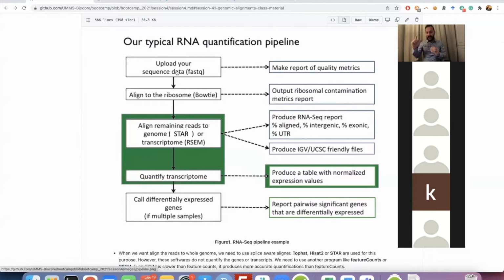Just think about that, you need to have about 10 times more space to process the data that you uploaded there. Just use du -h for the directory you uploaded the files to, and you can measure the size of the files you have there. Usually they are zipped files, and when they are zipped, we need to extract those files to start processing the data.